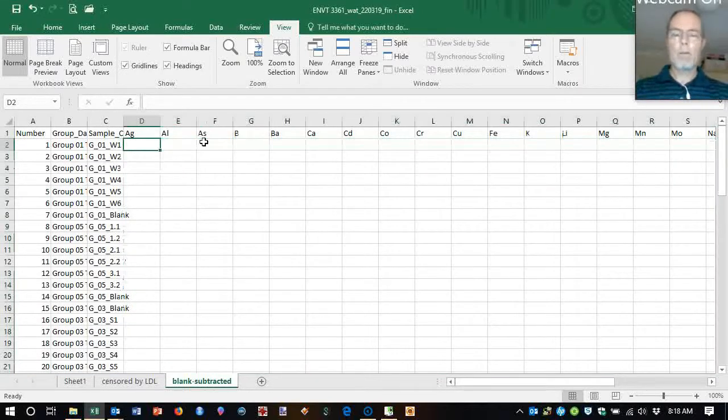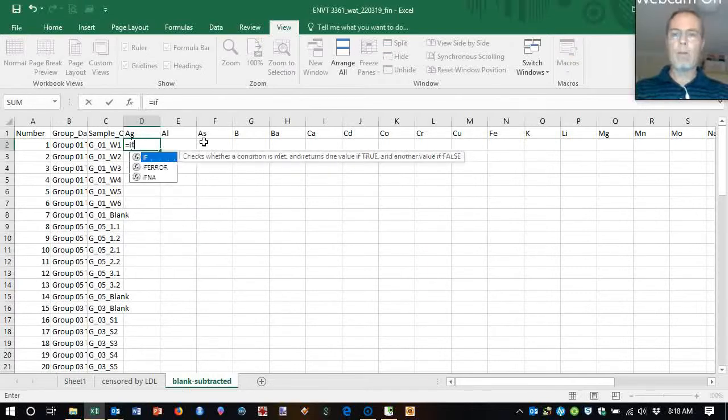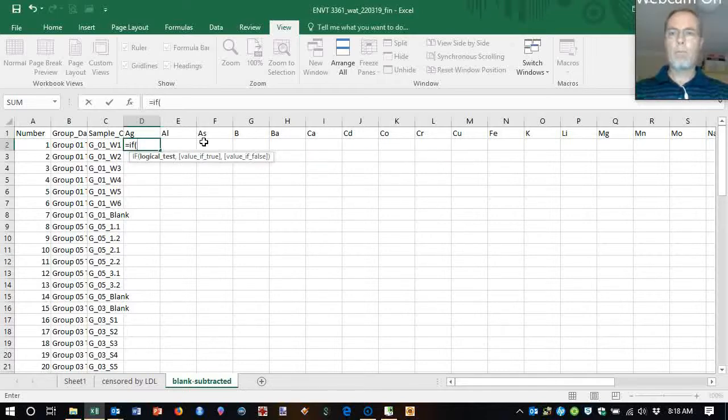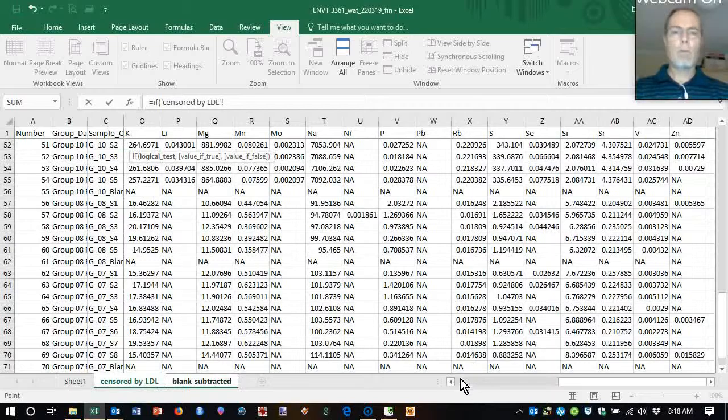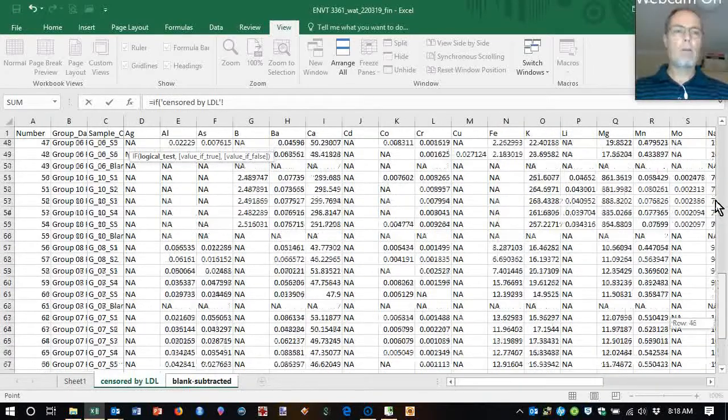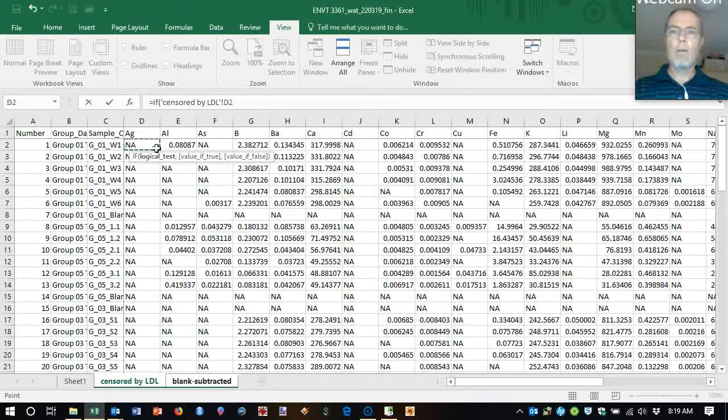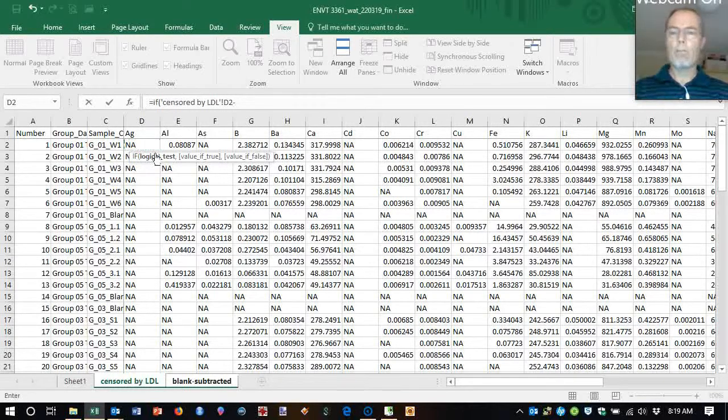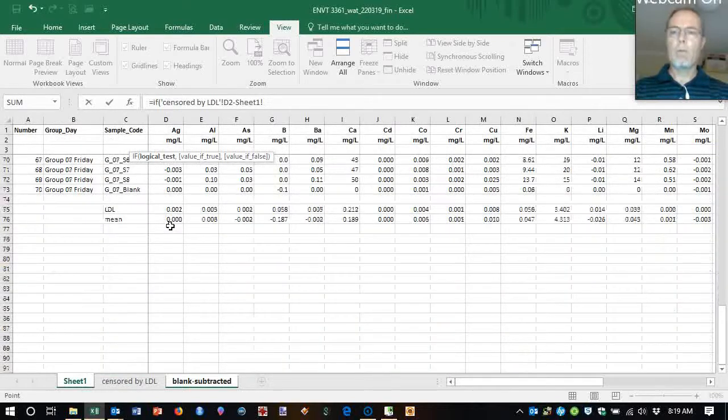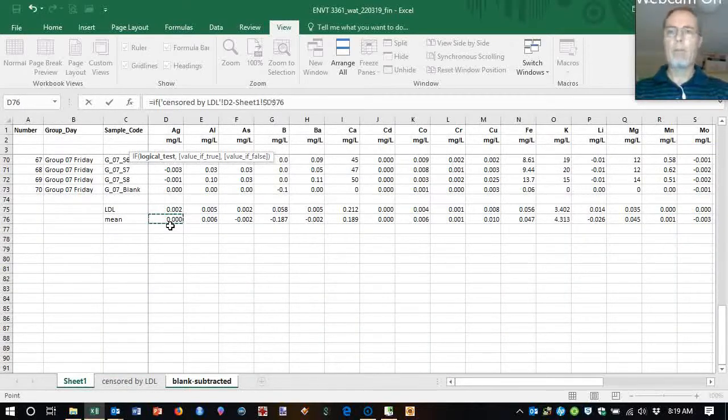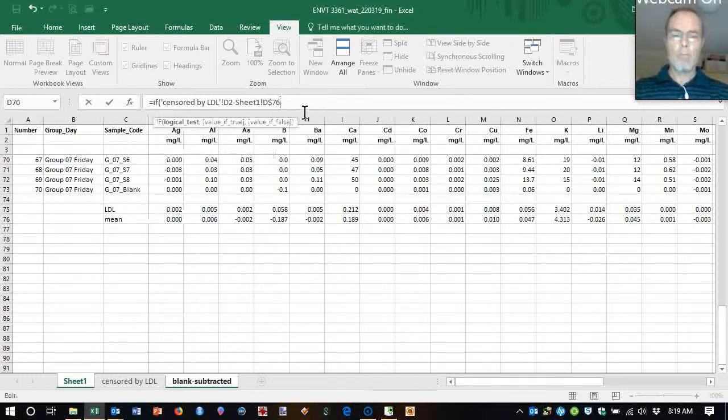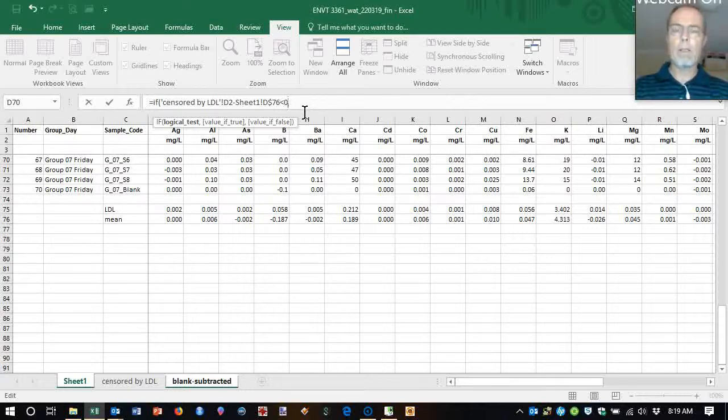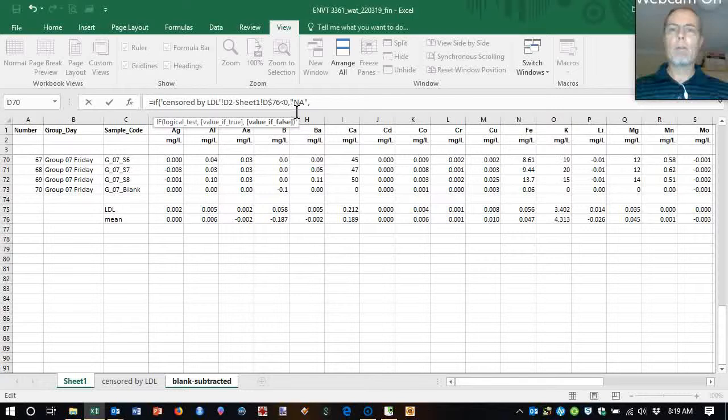So now I'm going to say if that minus the blank, let's fix that in place, is less than zero. If the value is less than the blank because we need to subtract the blank, then make that not available. But if it's not less than zero, we'll just use that formula.